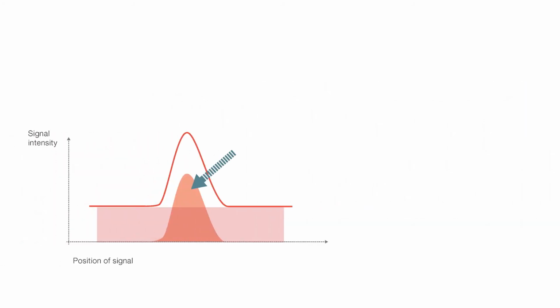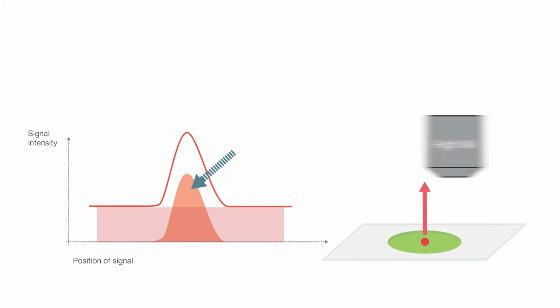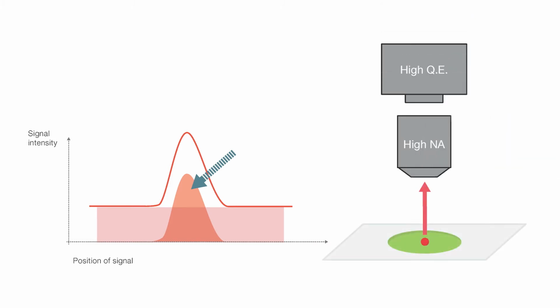You can achieve a stronger signal in a few ways. Although applying a longer exposure time or stronger excitation light can provide a stronger signal, these changes can worsen phototoxicity if not done carefully. As a result, a common strategy to improve SNR without any trade-off is to use a higher NA objective and a camera with a higher quantum efficiency.